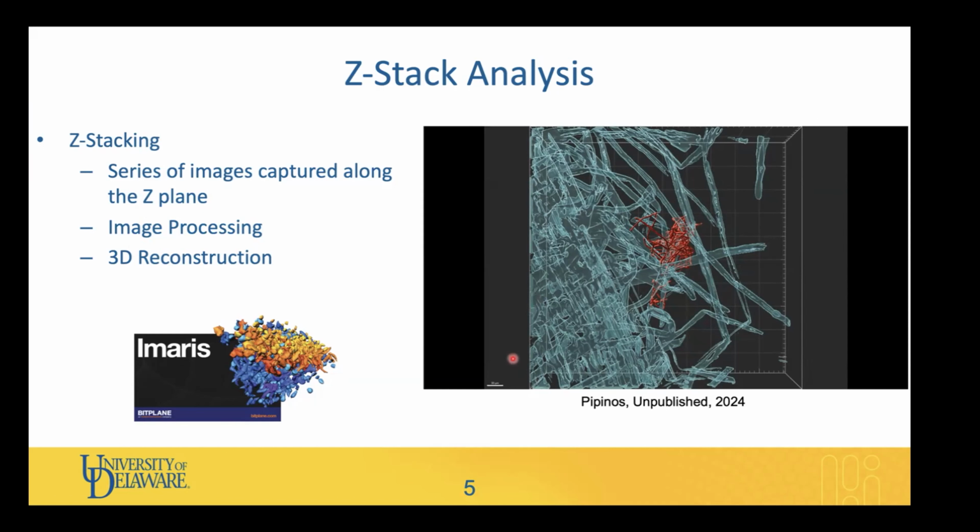Thank you. We do have a question in the chat. Could you clarify what specific super resolution imaging modality you implemented using the Dragonfly? Is it a single molecule localization microscope? Is it SIM, structured illumination? I think we just used the Z stacking aspect of the super resolution microscope, but I can check and get back to you on that.